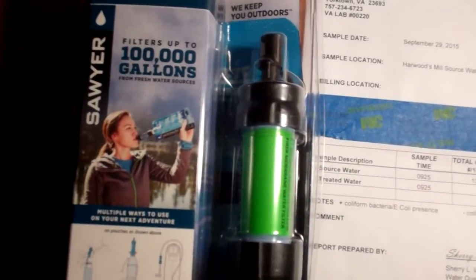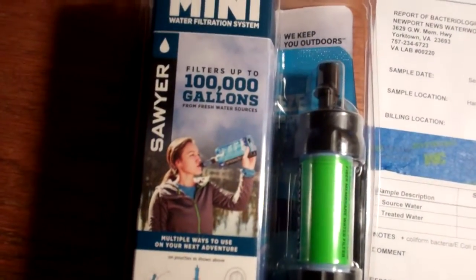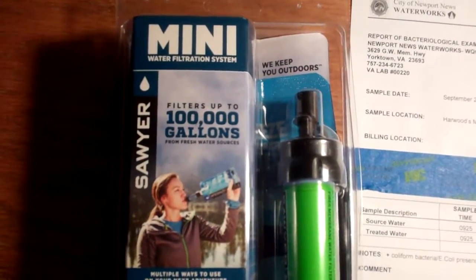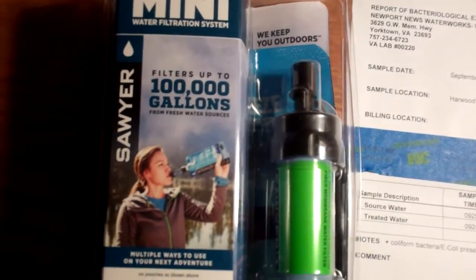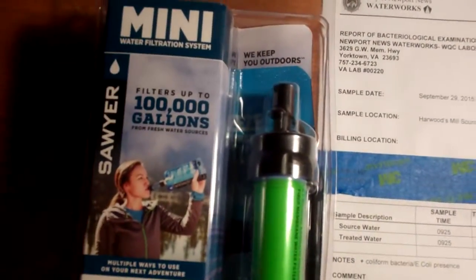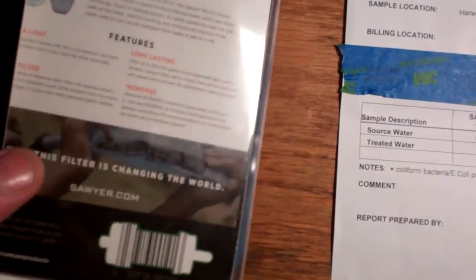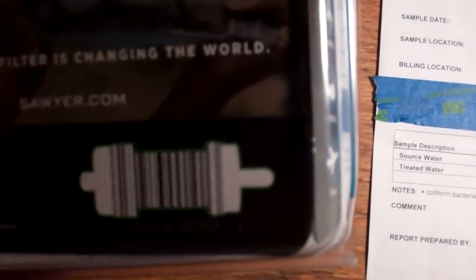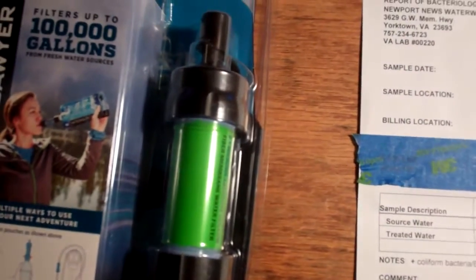A few weeks ago I bought the Sawyer Mini water filter. After watching a bunch of reviews on YouTube and doing some research on my own, I decided it looked like the best bang for its buck. You can watch videos all day long of people filtering water, but I had a question about their claim that it removes 99.99999% of harmful bacteria.